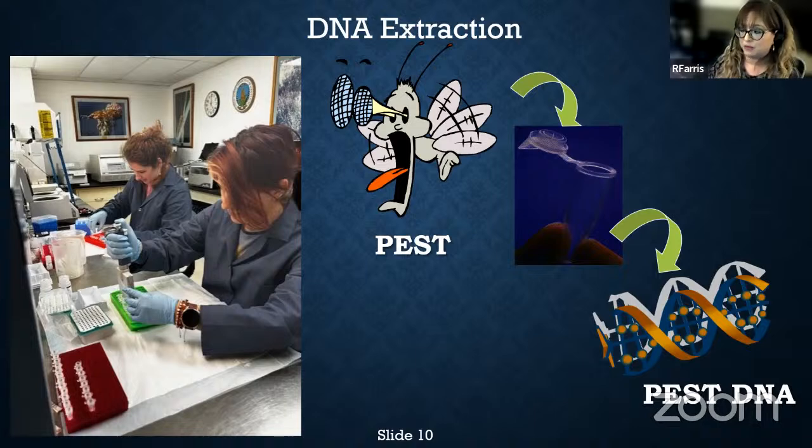It's like you're following a recipe, like I said. And in the end, you're going to get some DNA. There's an image right there on the left. We have two technicians there that are performing some of these extractions on some pest species.